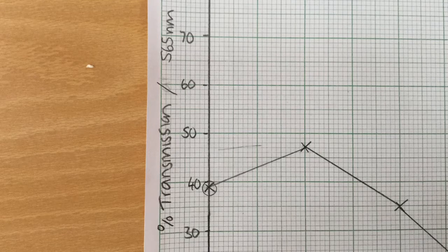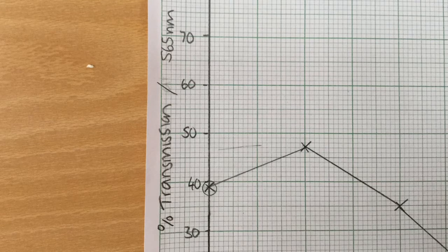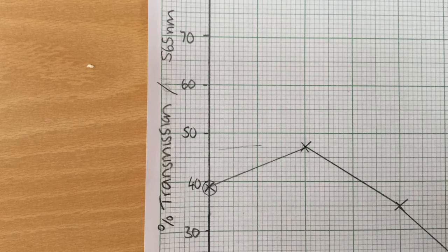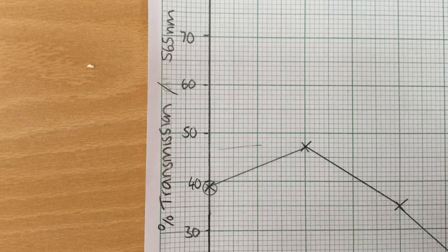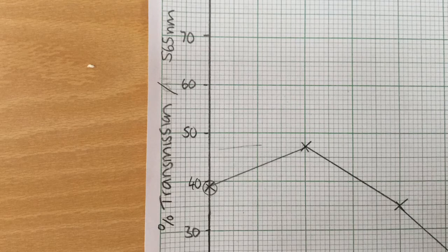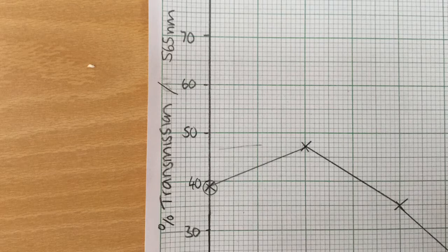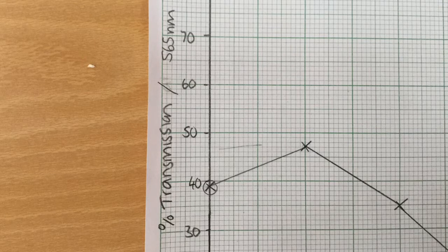Between 60 degrees and 85 degrees, there's very little variation in the leakage of pigment from the cell. The permeability of the membrane doesn't change very much at all. So in describing the graph, we can comment on three very distinct phases.